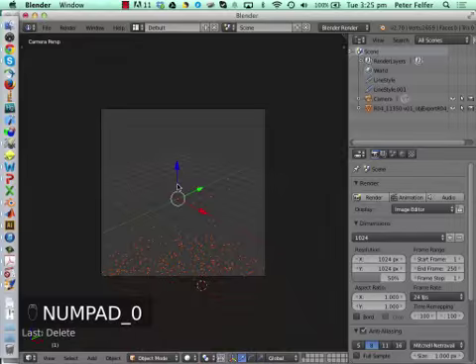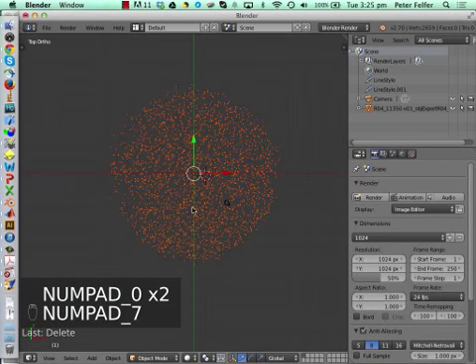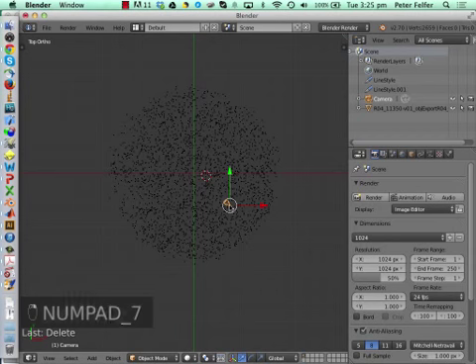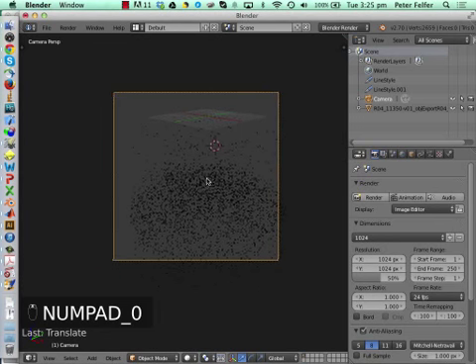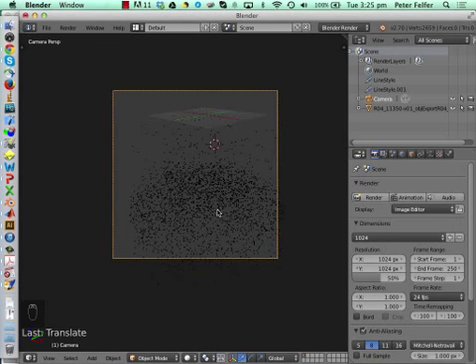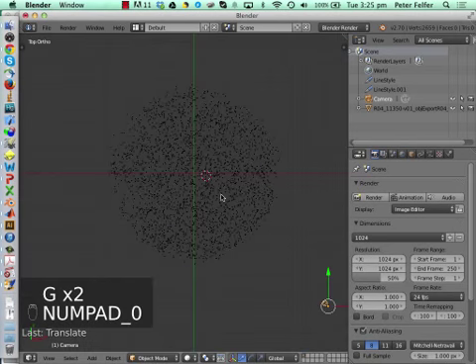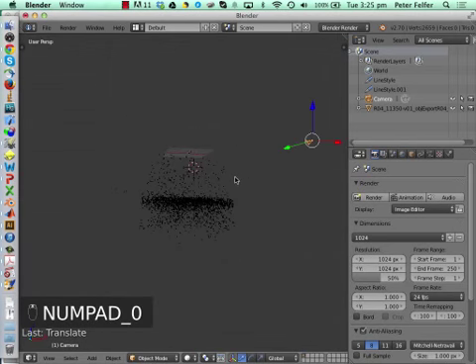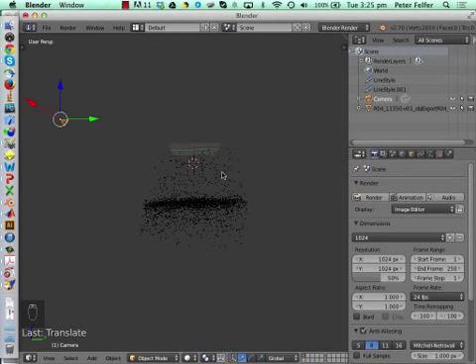And as the next step, we'll move the camera. So we'll go and grab the camera and move it somewhere where we can actually see a lot. And there we go. If you don't have a camera in your scene because you've deleted it, then you add the camera by just right-click, or Shift A, and add camera.